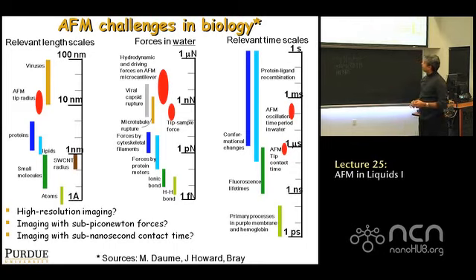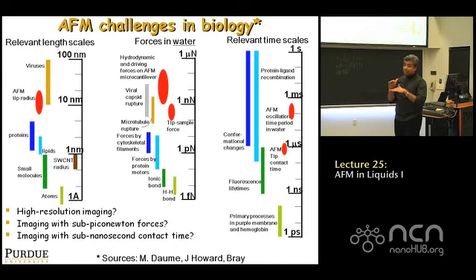On the other hand, if you're looking at protein crystals, like bacteriorhodopsin, for example, which is a membrane, but it consists of tightly packed protein clusters. For that kind of sample, going up to 5 nanonewtons is not such a big problem. You can still get a reasonably decent height out of it because it's a pretty stiff sample. All right, so you do need to worry about the forces depending on what you're dealing with.